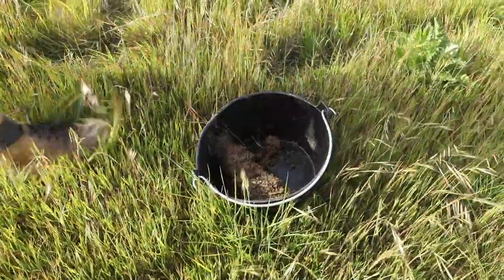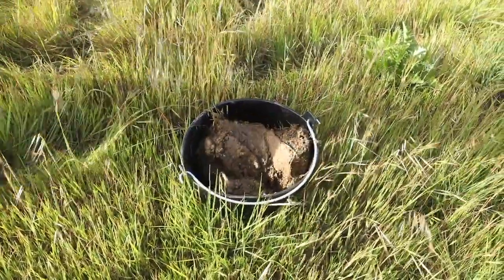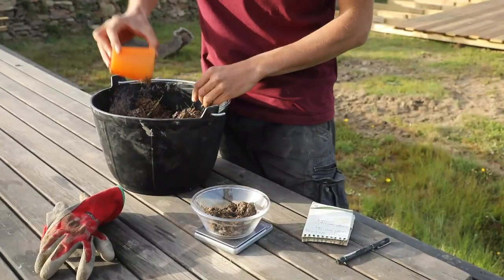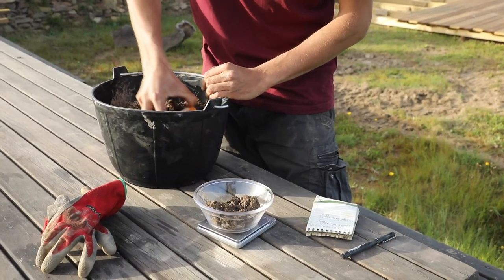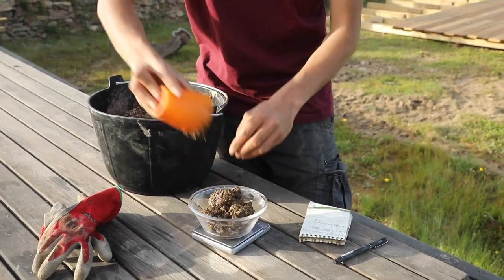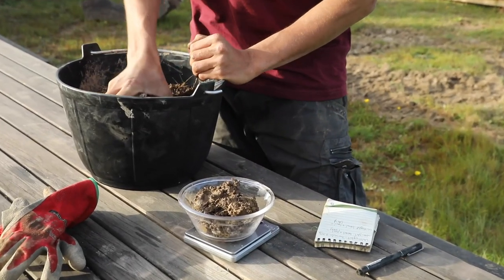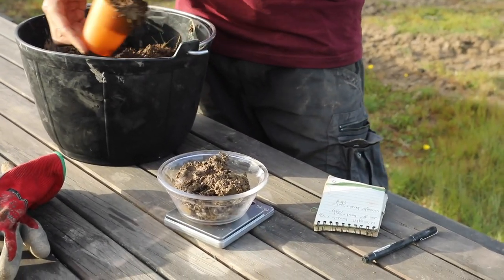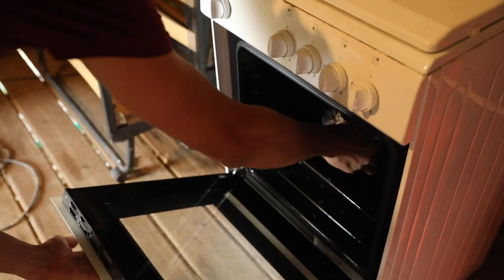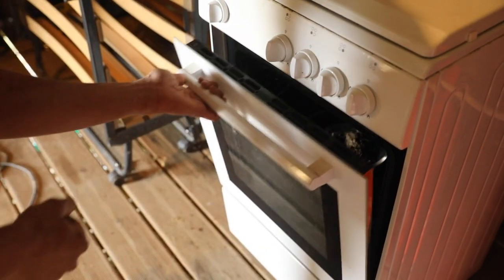Then mix the samples together and omit any roots or stones in a bucket. Take about 3 to 6 cups of the mixed sample and put it on a pan or another high temperature container. Zero the scale, weigh the soil and record its weight.